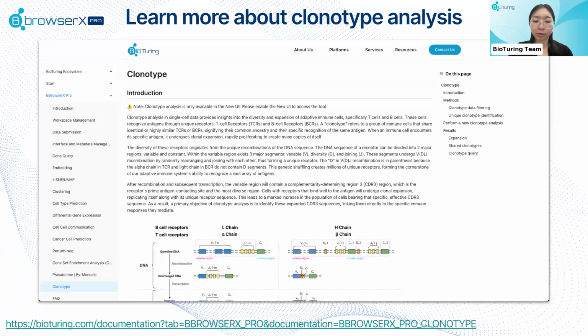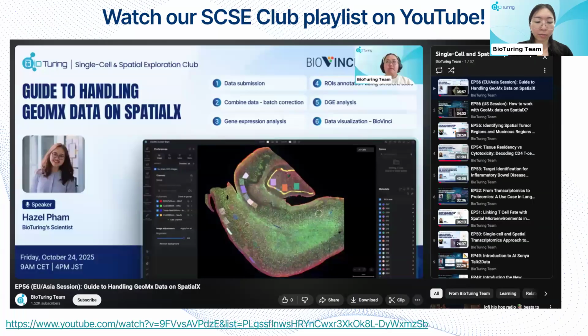Okay, in a second I'm going to open up the poll because this is the first iteration of our clonotype analysis tool. In our next iteration, we want to know what you are interested in seeing next. Some of the things that we might add to our tool are, for example, diversity analysis, which will tell you how diverse your clonotypes are within your patients, and antigen or epitope prediction.